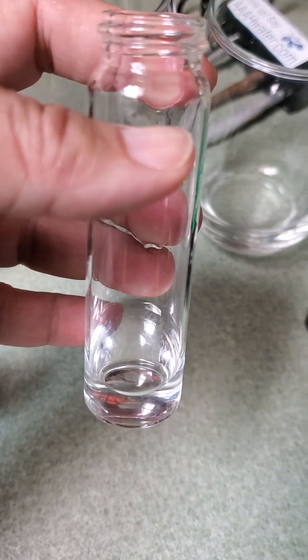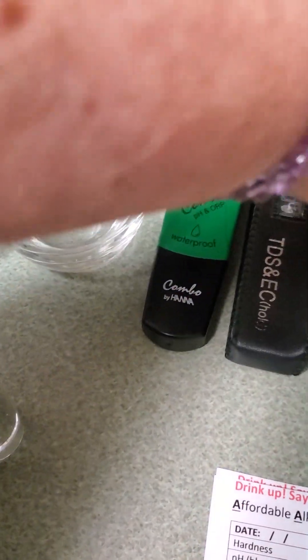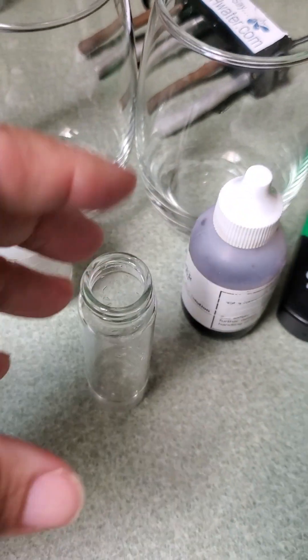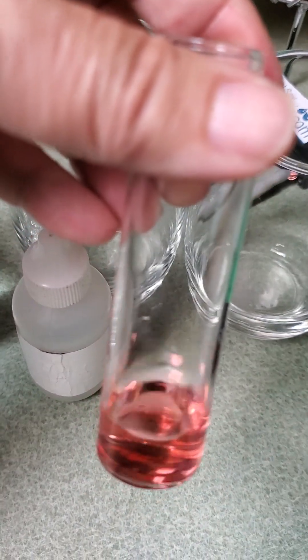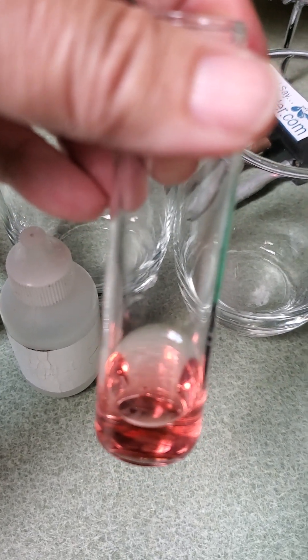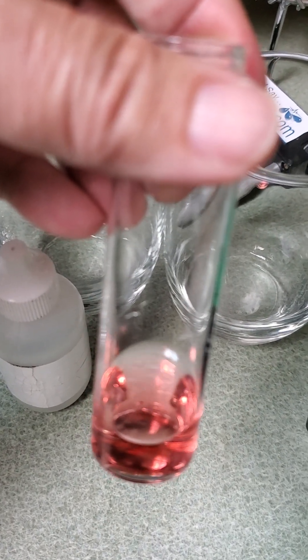We filled it with the same amount of water again and this time we're adding the reagent — five drops — then we'll count how many drops of titrant it takes to turn the water blue or gray. I've added the five drops of the reagent and you can see this is pink, which indicates hardness in the water. Why they're selling hard water at the grocery store makes no sense to me, but let's see how many drops of titrant it takes to make it go away.